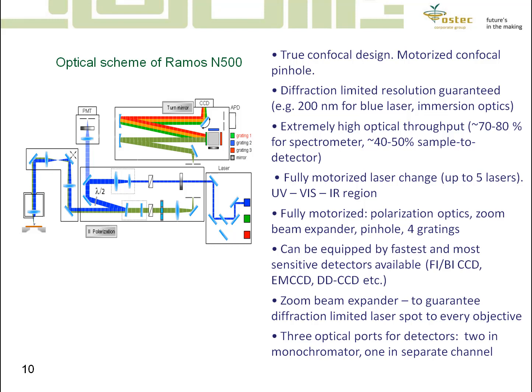And different output ports allow us not only to perform Raman spectroscopy but also fluorescence imaging, also fluorescence lifetime, and some other advanced optical techniques.